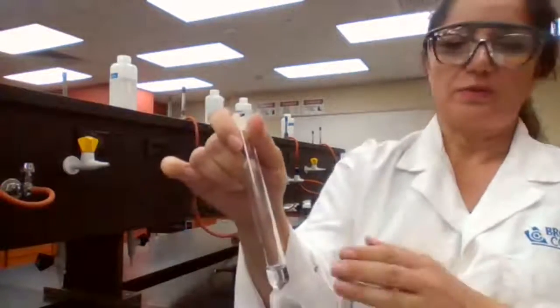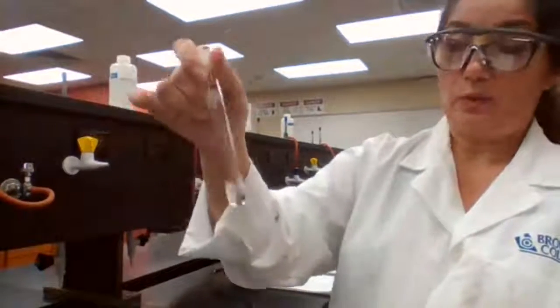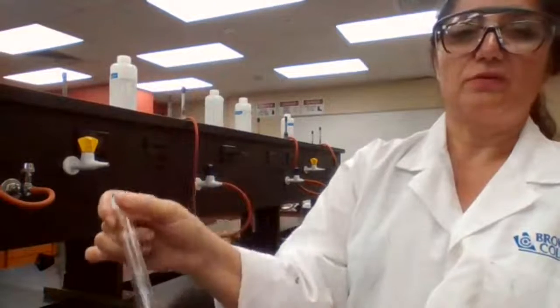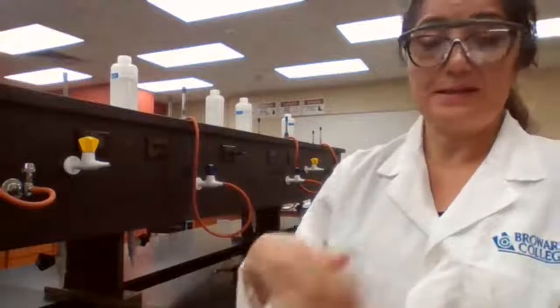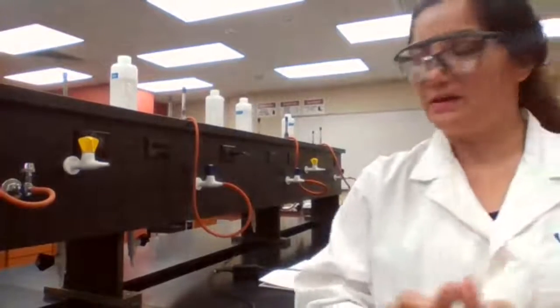What happens when the ammonium chloride in water is being heated? Would it dissolve better, or if it's cooled down, would it dissolve better? If heat is needed for something to dissolve, the reaction is considered to be an endothermic reaction, as I said earlier. So we are done with part C of the experiment.